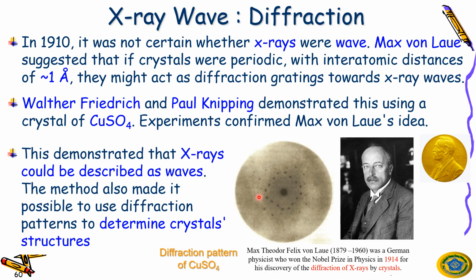So Laue found this actually. He wanted to prove that X-rays behave like a wave. And then these two gentlemen proved his idea, Laue's idea, by using this crystal.